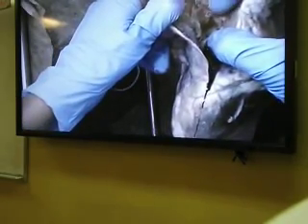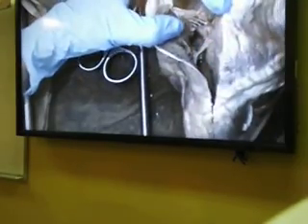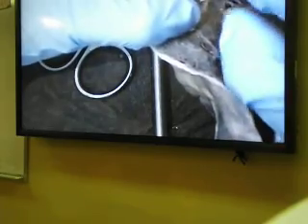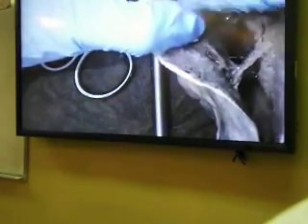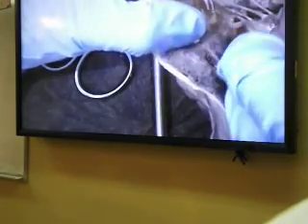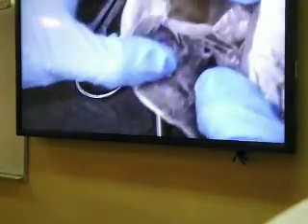Chordae tendineae, you see a string commonly called heart string, and chordae tendineae is joining the tricuspid valve, valve is right here, to the papillary muscle, which is this bump. Papillary muscle is on the floor of the ventricle.